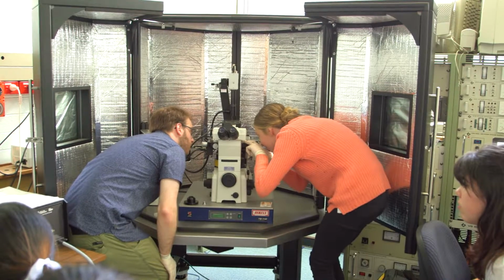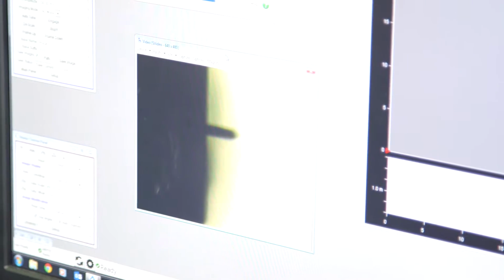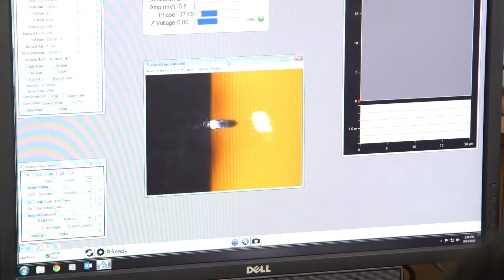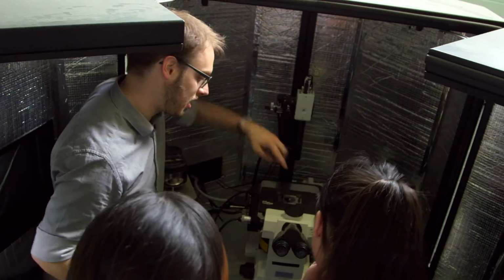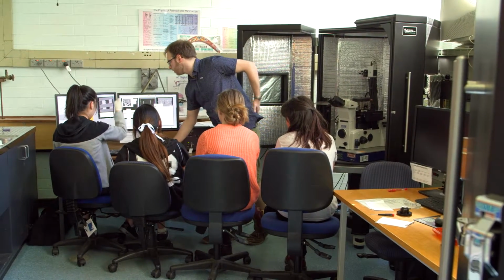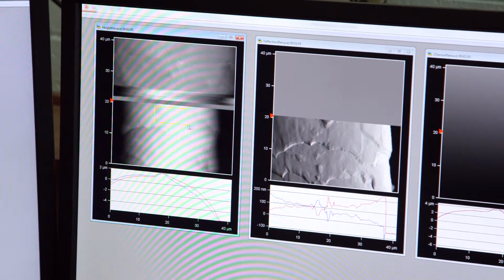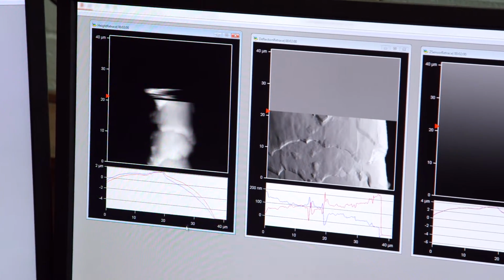There's a probe, which is very small, and it's attached to a cantilever. And this cantilever either slides across the surface or it bounces on or just above. And as it moves, the point of deflection of the laser beam, which shines on the top, changes and hits different places on the detector. So the height retrace scans the surface to determine the different heights of the surface of the hair, and we're able to determine the width of the hair from the red and blue lines.